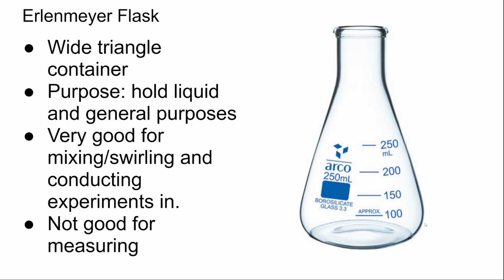Once again, they also have the same downside of a beaker, which is that they're not very good for measuring, and that's probably because they have a lot fewer lines, and also these lines, once again, are usually not very accurate themselves.